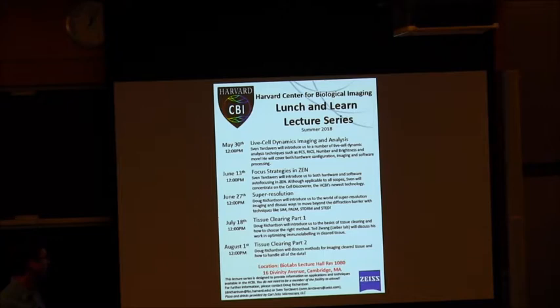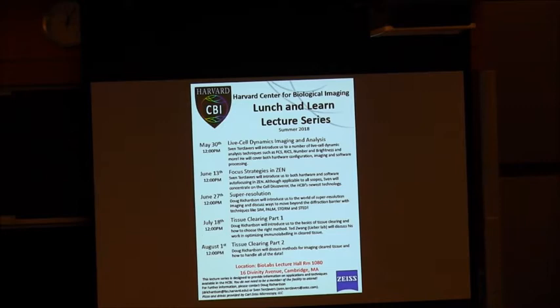And then for part two next time, I'm going to go into a little more detail about how we actually image these tissues, so which microscopes we use and which are the best techniques for doing that. We'll also talk a bit about what we can do with all the data, because obviously when you're imaging something big, you get a big file in the end. Okay, so that's the plan for the next two weeks.